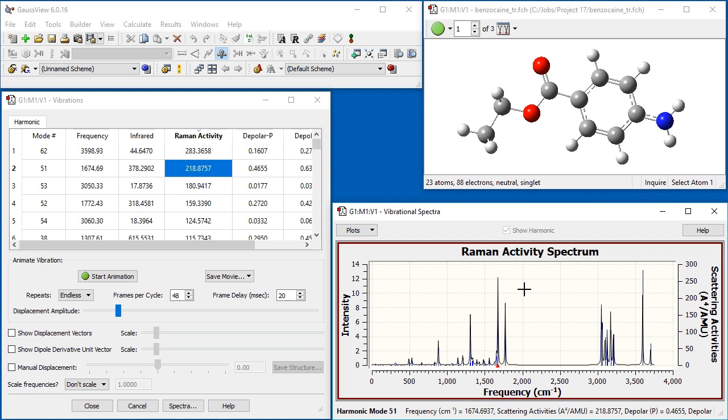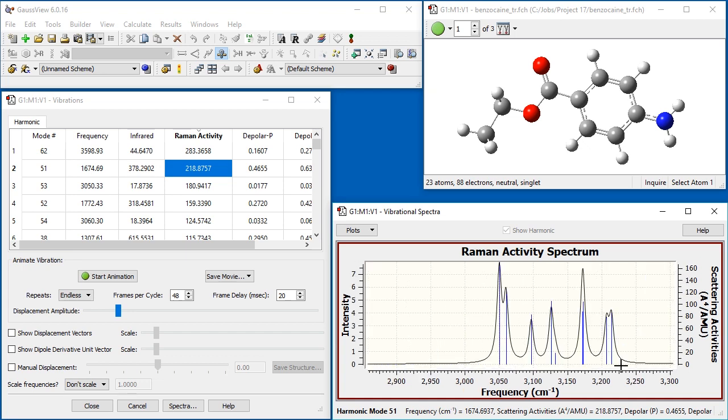There are many peaks quite close together and we would like a more detailed view of the range above 3000 wavenumbers. Clicking and dragging a rectangle within any spectrum display zooms in on that portion of the graph. You can repeatedly zoom as much as you like.